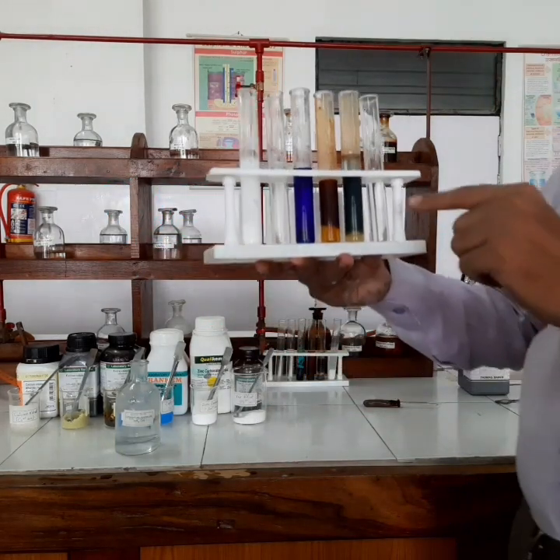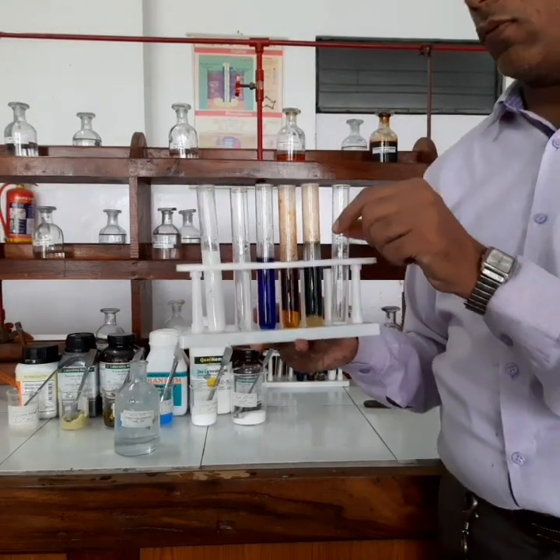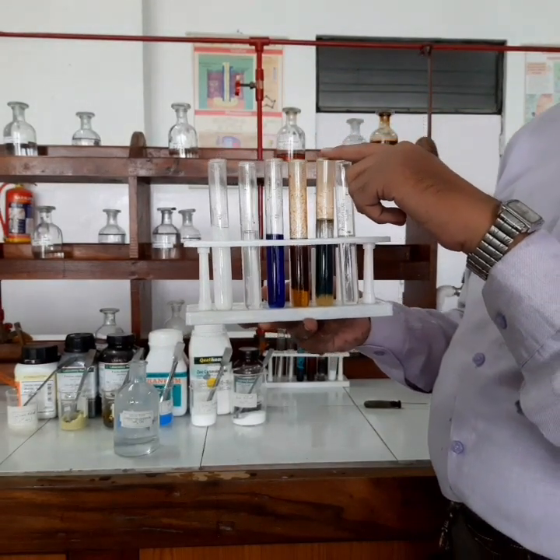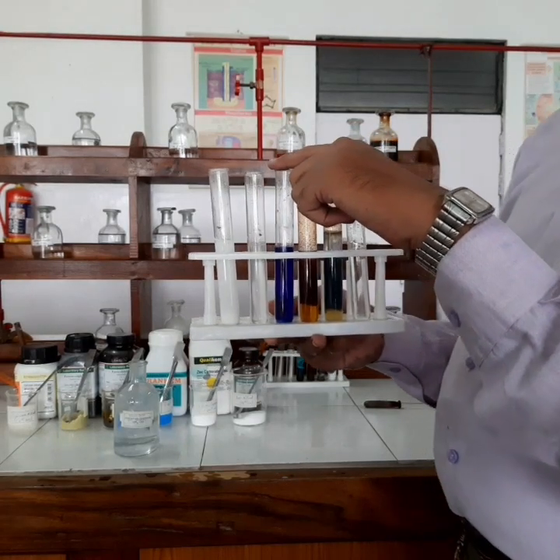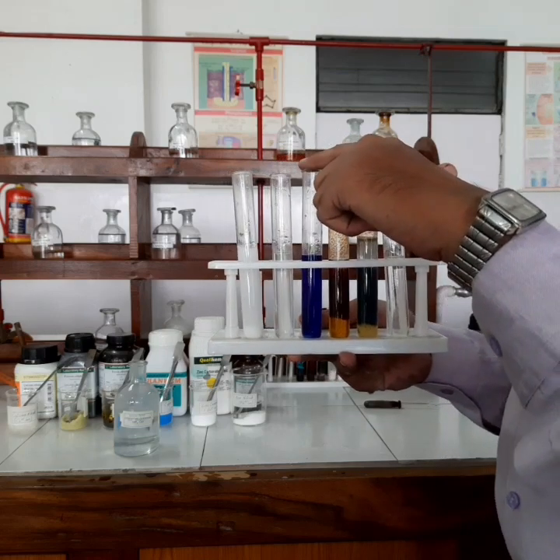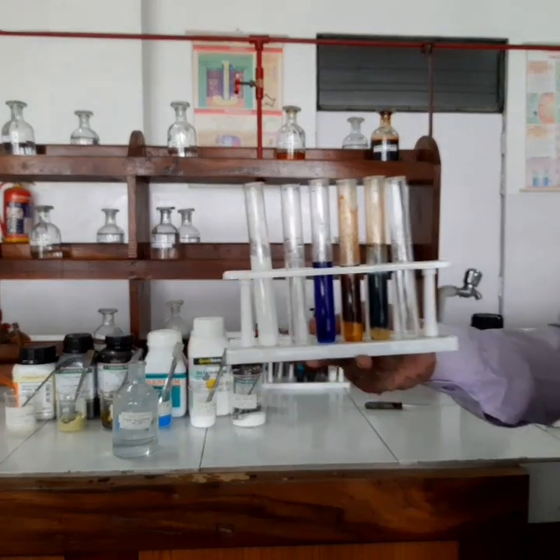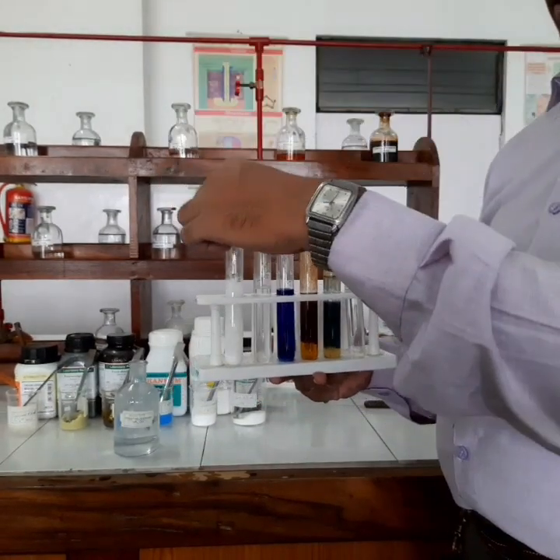So this was the case of calcium. No precipitate is forming in case of calcium ion because of the low concentration of OH minus ions, because calcium requires a high concentration of OH minus ions. Then ferrous ions form a dirty green precipitate, insoluble in excess. Ferric ions, reddish brown precipitate, insoluble in excess. Copper, pale blue precipitate, and forms a soluble inky blue solution because of the formation of tetraamine copper(II) sulfate. Zinc was forming a gelatinous white precipitate, which again becomes soluble because of the formation of tetraamine zinc sulfate, and lead, which is chalky white and insoluble in excess.